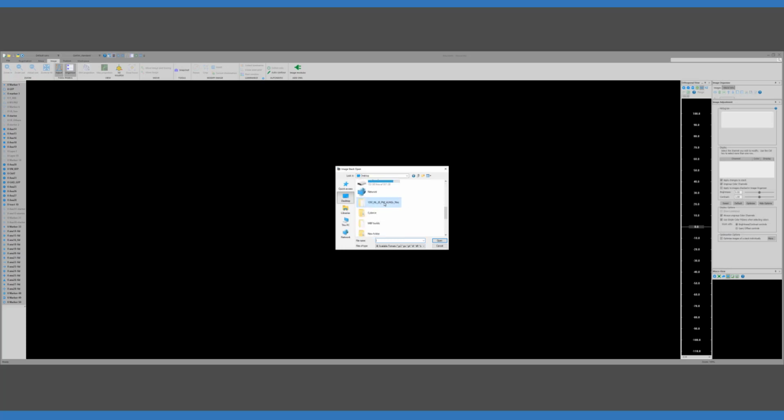Yeah, I'm just searching through the thing. Sorry about that. Sure. No.